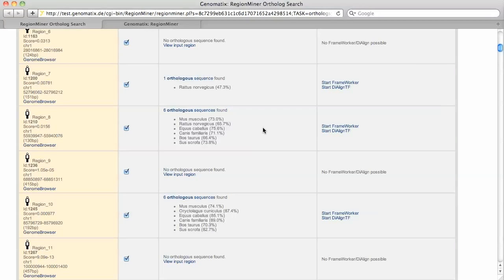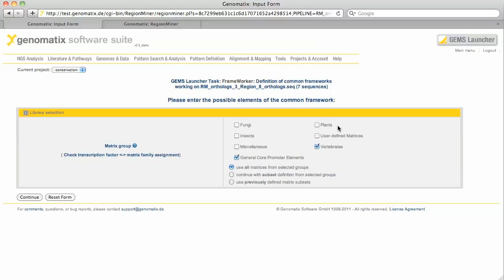With FrameWorker to find common patterns of transcription factor binding sites and with DialITF for a sequence alignment including positions of common binding sites. Let's run a FrameWorker analysis. We will be looking for patterns that contain core promoter elements and vertebrate binding sites.